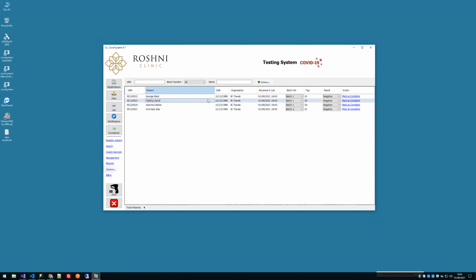To be honest, most of the tests, based on my knowledge and data that I've seen, are negative. So then they can say, okay, the easiest way to do it is all negative, but that test was actually positive, and that test was actually positive. So it's an easy thing to mark the results as positive this way, and the certificates will be marked as such, and you can complete these items. You can move them to complete once they're done, also, and so on.